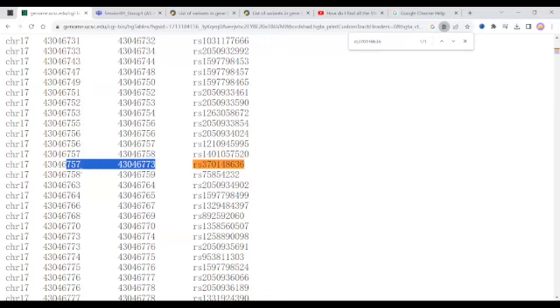So if I ask how many SNPs in that file, you have to exclude those from consideration. By how? Using some custom script, or you can use Excel, column C minus column B equals 1, or like that. You can use a macro. Right? Yep. Great, thank you. Any question about this SNP exercise?